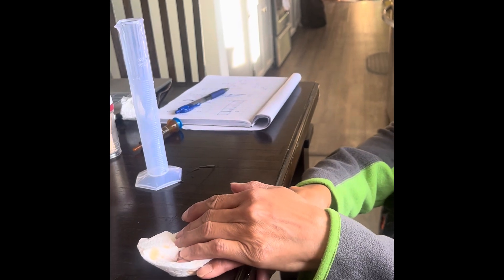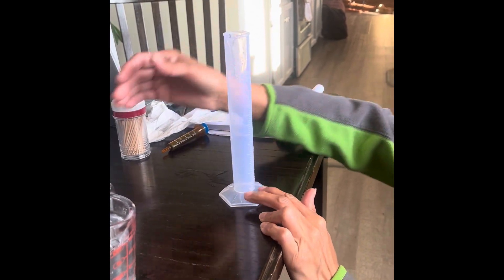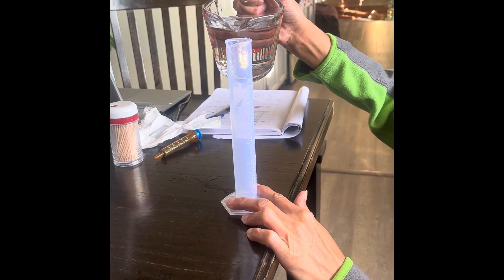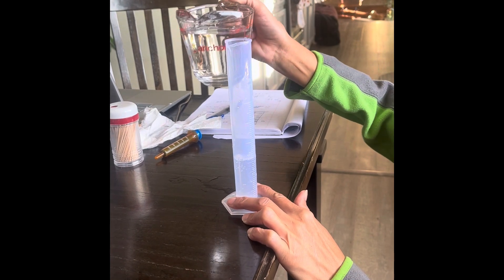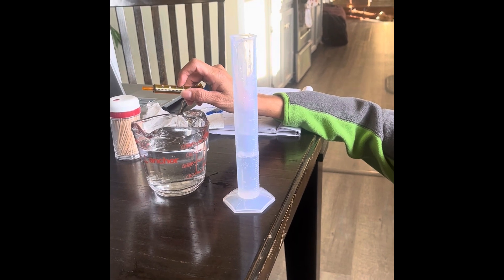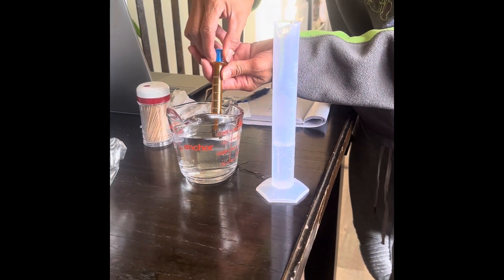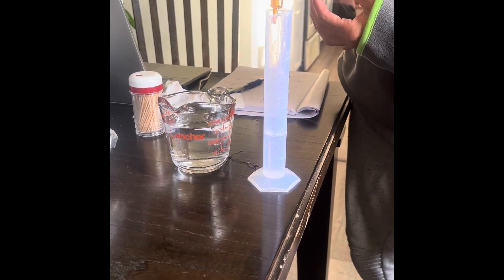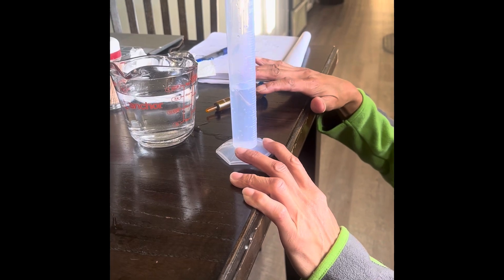Now I'm going to do 26 milliliters. 21. I have to put 4, 5. I made 26 milliliters.